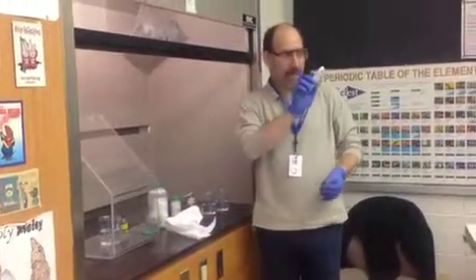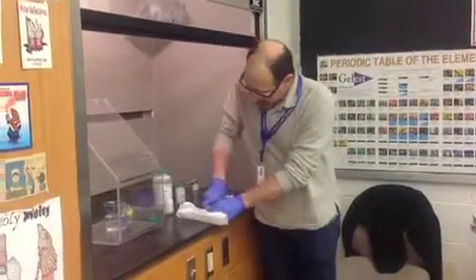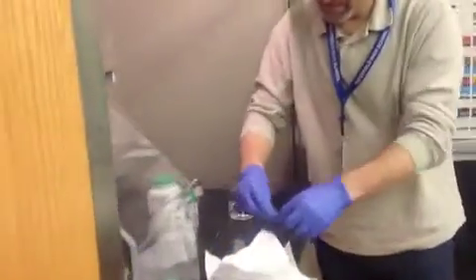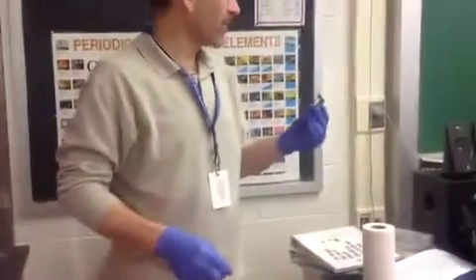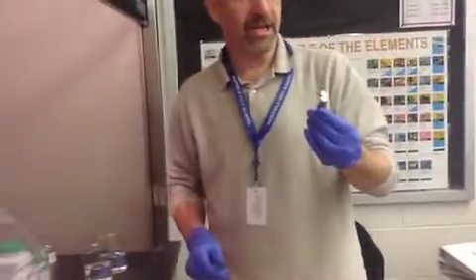First of all, I can cut them open with a knife. This one's kind of hard, but when I do cut it open with a knife, I expose a nice, clean, bright surface underneath. That hasn't been exposed to oxygen yet, so you see how nice and shiny it is.